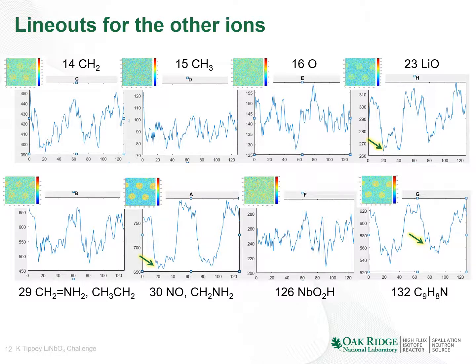So I did this for the rest of the species of interest and found peaks in the hydrocarbons and the oxygen-containing species, especially this lithium oxide type thing, and some hydrocarbon or nitride that is probably resultant from the making of this material. At this point, I would take the data and talk to the experimenters and see what they think is actually the most interesting features to follow up with. That's what I have.